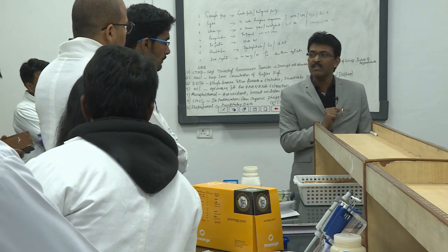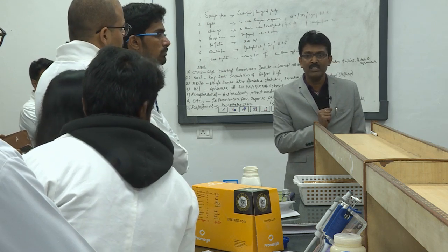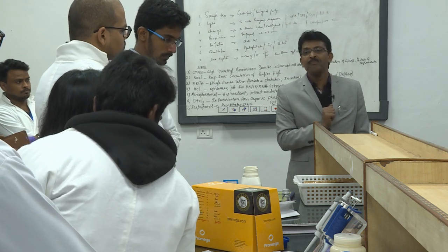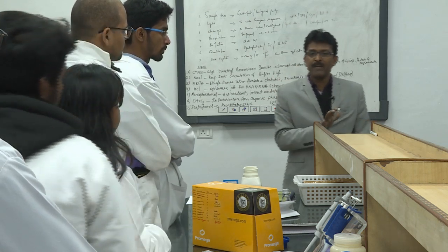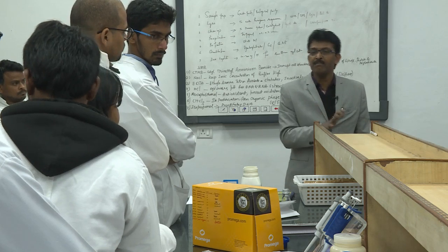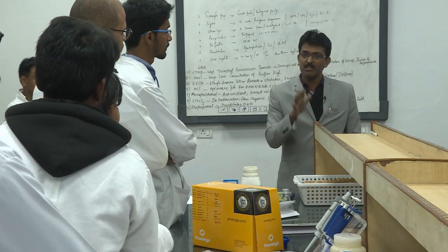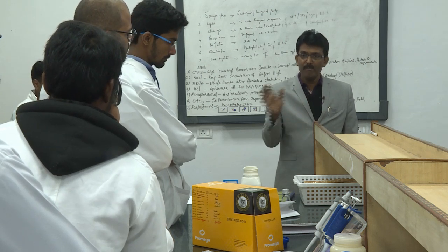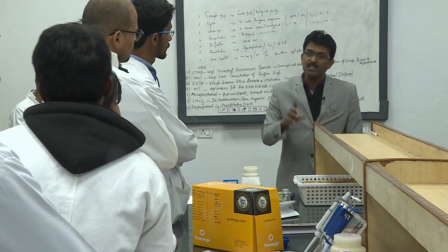Okay. Anybody else? Anything else? Question? Any other quick one? Okay. If no more questions, today's practical we are going to wind up by setting up the PCR. Once the machine is on, you can leave today and come back tomorrow at 9:30, right.